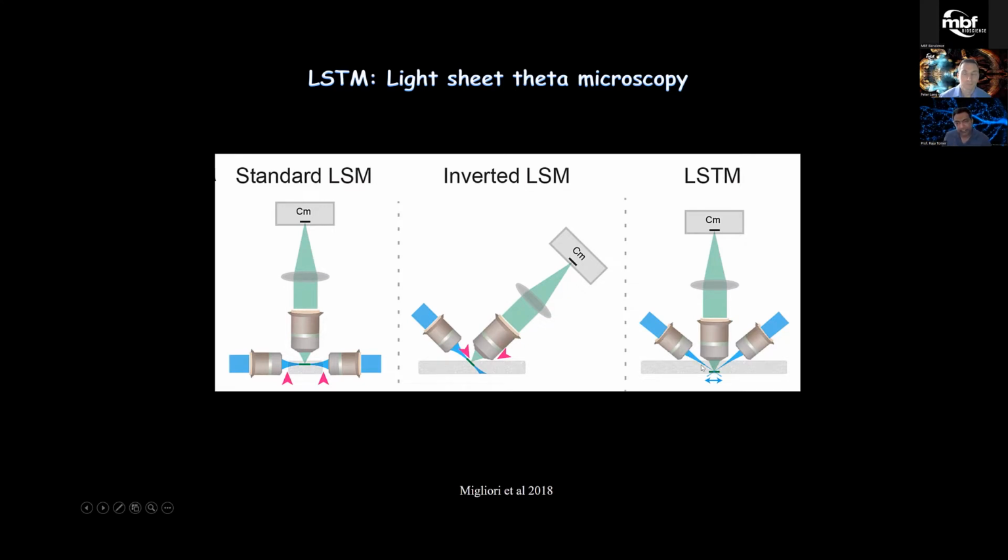Then we can reach our detection plane with this thin sheet of light, which intersects the detection plane in a line illumination, right? And then with this optics trick, we can quickly scan that line in the detection plane, and hence achieve planar imaging.